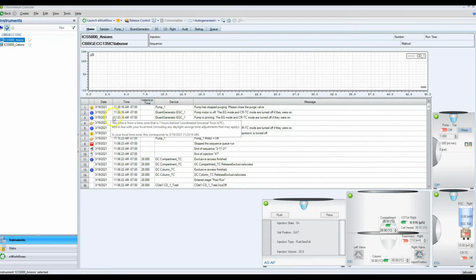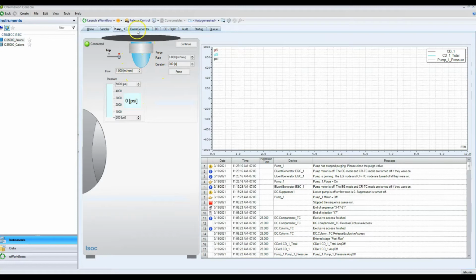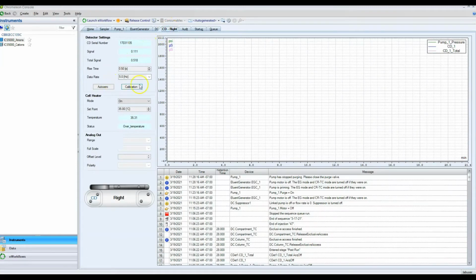We have all these tabs at the top for both cations and anions. Each one corresponds to a different piece of equipment in the instrument. So this one is for the auto sampler, and there's a ton of settings on each of these, so don't get too concerned yet. This one's for the pumps. This one's for the eluent generator. This means detector compartment. This means conductivity detector. This is one of the most important ones. And these three aren't super important, but we'll talk about them later if we end up needing them.